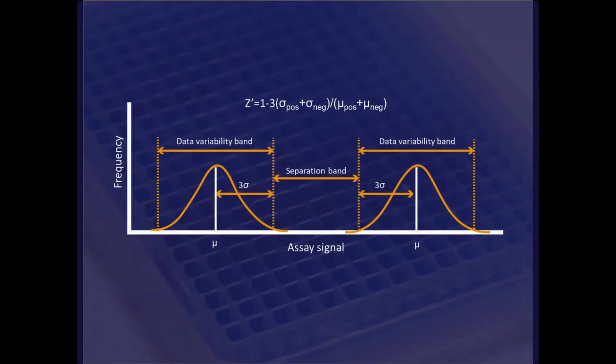Assay variability. This is measured using the standard deviation of the control wells to calculate the coefficient of variation. Z prime, Z factor, and Z score. Each method provides a statistically relevant value that determines the reproducibility of your assay controls. This takes into consideration the standard deviation of both the positive and negative controls, along with the assay window and the activity of any compound outside of a null effect across all samples on the plate.